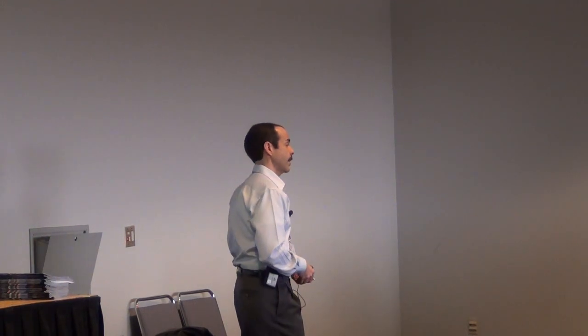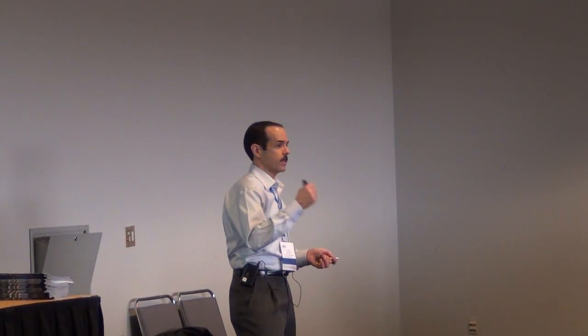Pretty good response from the electrode. Repeatability is plus or minus 0.02. You can get these as a refillable electrode or as a gel-filled electrode. And the only disadvantage is temperature. So if you're working with a cold sample, let's say you calibrate at room temperature and you stick that in a cold water sample, it's still going to take a while for that electrode to stabilize.